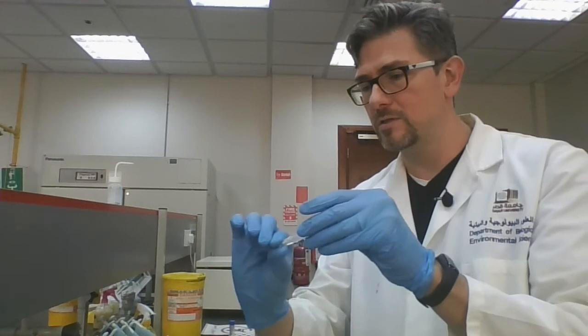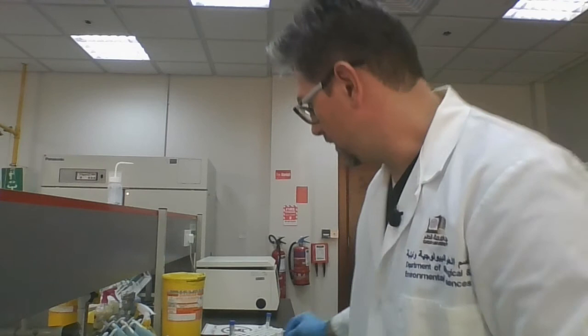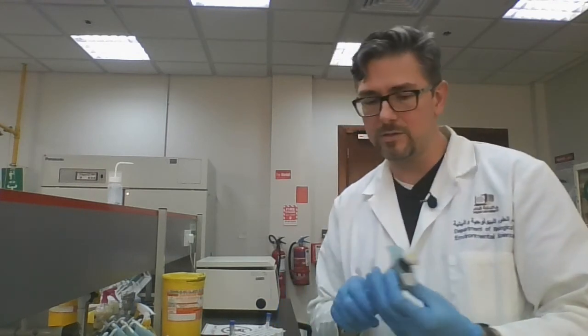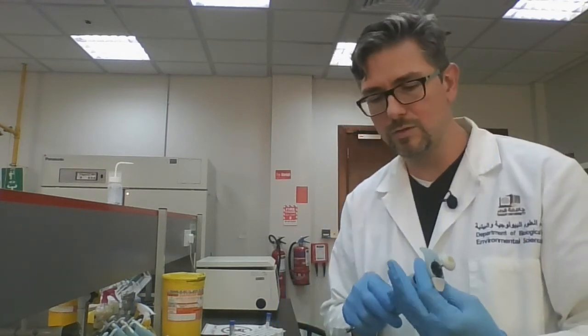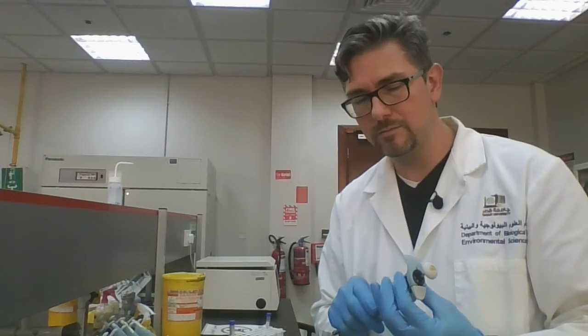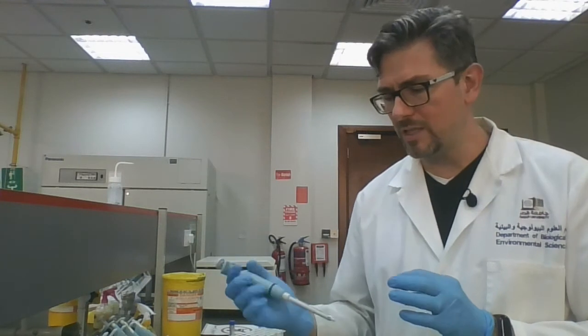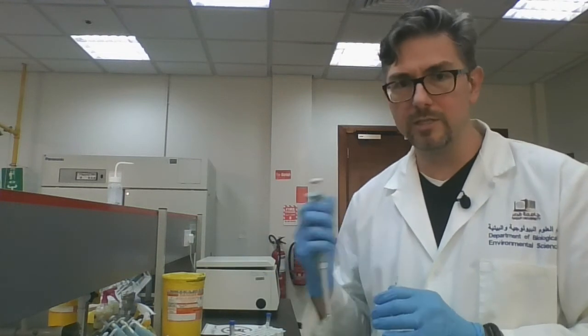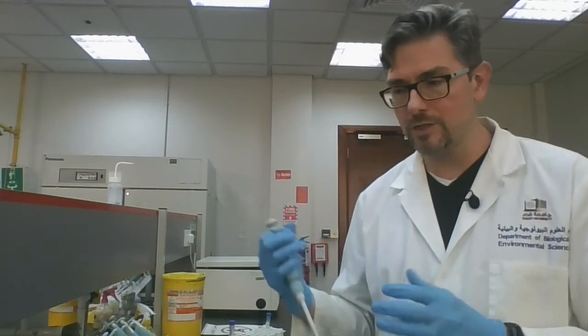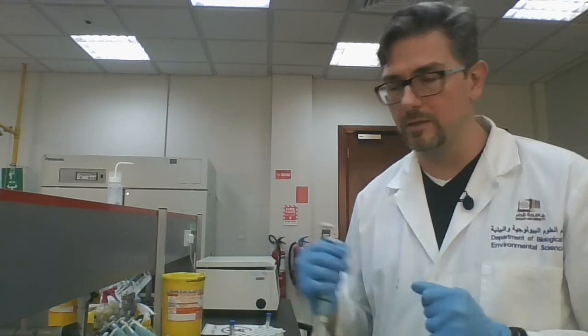So let me just put this down. I'm actually going to take a P200 and use it instead of a P1000, just to make sure that I'm able to take up the small amount that I need without disturbing the bottom layer. The reason I'm doing that is because the tips for the P200 are thinner, and so you're able to take materials up more easily without disturbing that bottom layer.